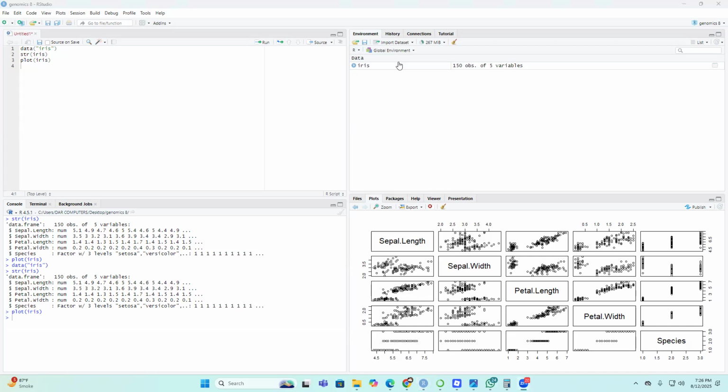Please all participants confirm. If you have any issue or found any error, you can let me know. For Manali, this data is already available in R, so you don't need to worry. It's a default data set available within R.